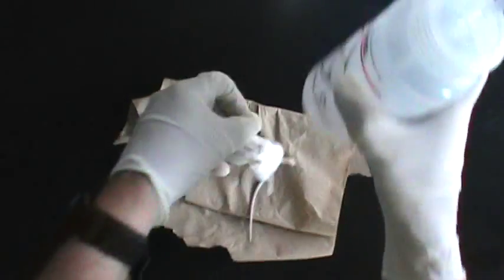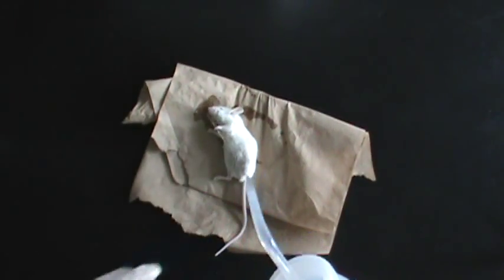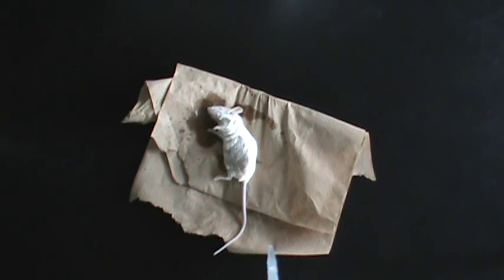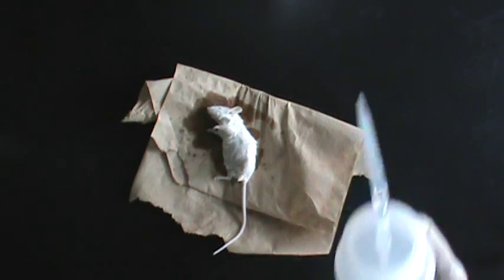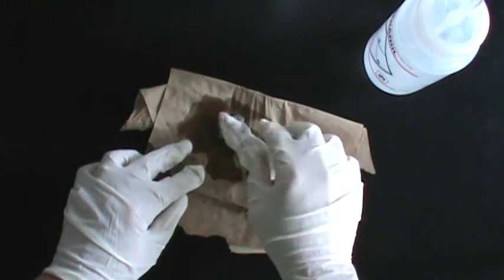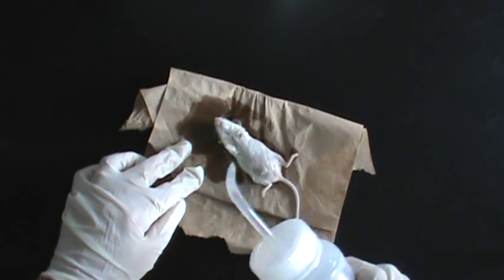The mouse that we will use will already be sacrificed for you in a humane manner using an overdose of carbon dioxide. Place the mouse on a piece of paper towel and soak it with ethanol. This does two things: it helps keep the area that you're working sterile and it also keeps the fur of the mouse from getting all over the place.